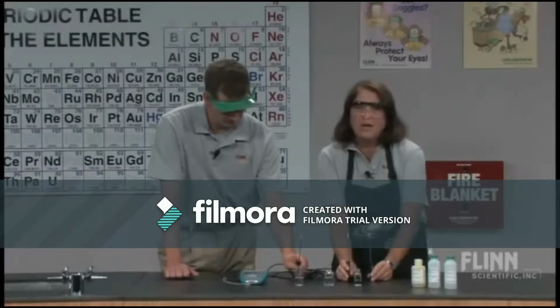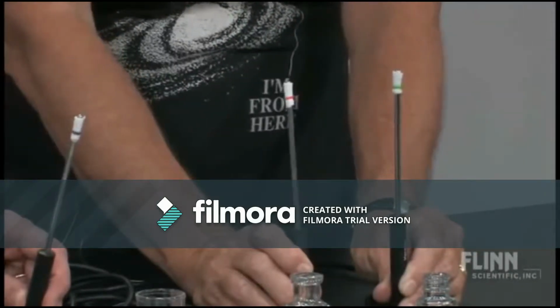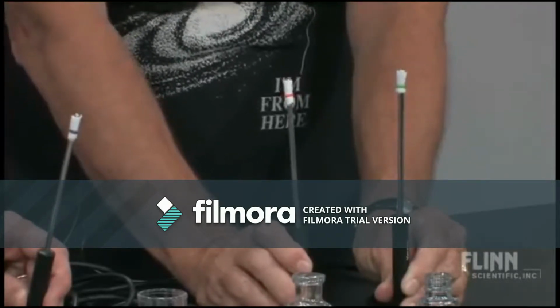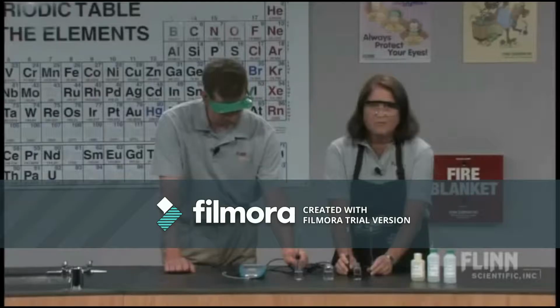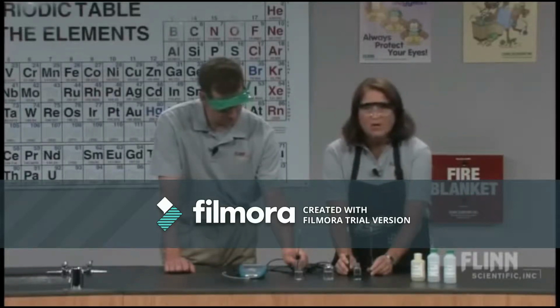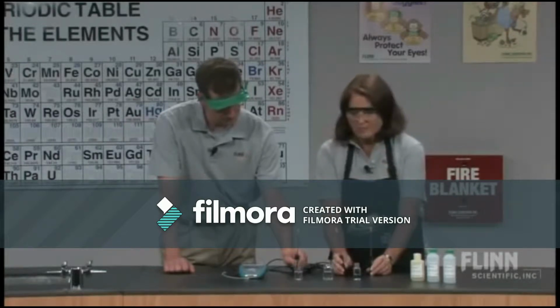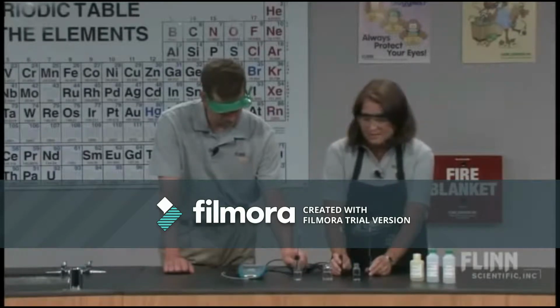Now, I give 3 probes to my students, and they're simply told to wrap a paper towel around the probe. They're not told how to do it, just to get the job done. And their only instructions are to be sure that whatever they do, all 3 probes are treated exactly the same. The same amount of paper towel, put at the exact same position, the exact same way. You want to make all 3 identical. So I did all 3 wrappings.